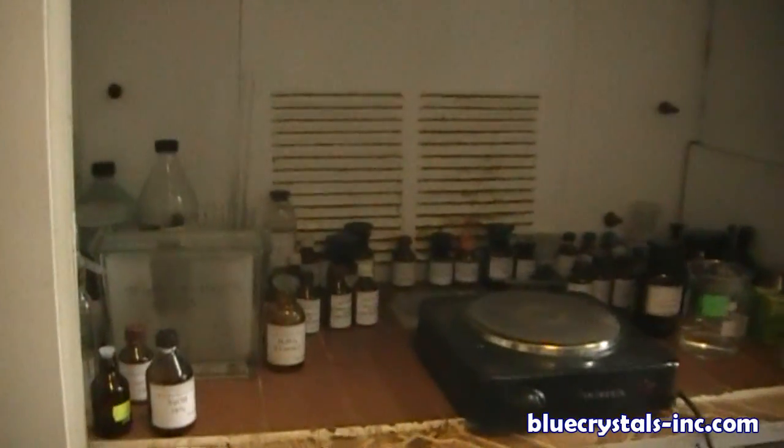This is the toxicology room, and I like the toxicology room. Over here you will also have the chimney, or something like that, for picking off smells and odors from the laboratory.